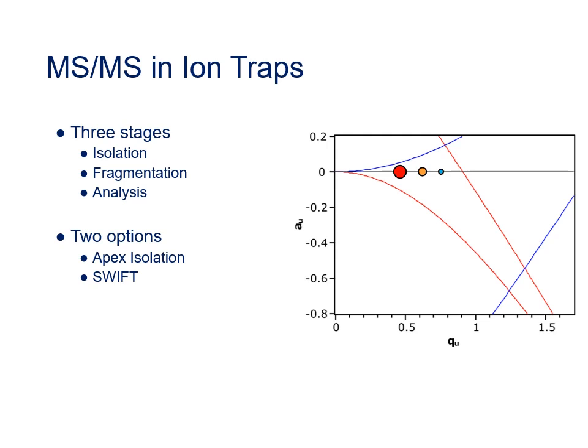The second method of isolation relies on the fact that ions of different mass to charge ratios oscillate inside the ion trap with different frequencies. Remember that if we apply a tickle frequency that is the same as the ion oscillation frequency, we can eject that ion from the ion trap wherever it is in the stability diagram. We don't have to wait until it gets to a boundary. So if we knew the oscillation frequency of any of these ions, we could eject them straight from the trap just by applying the right tickle frequency.